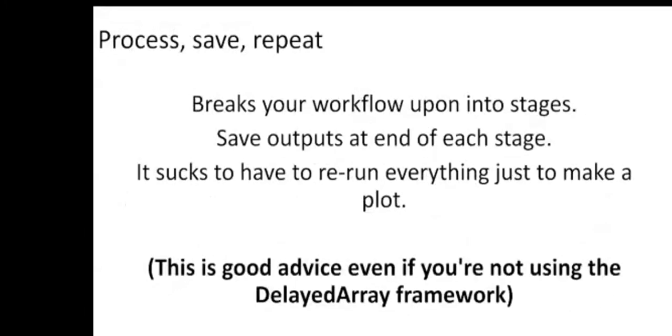When working with large data, it helps to break your workflow up into stages. At the end of each stage, save your outputs, for example using the saveHDF5SummarizedExperiment function. It really sucks to have to rerun everything just to make a plot, and this is good advice regardless of whether you're using the delayed array framework or not for processing large data.